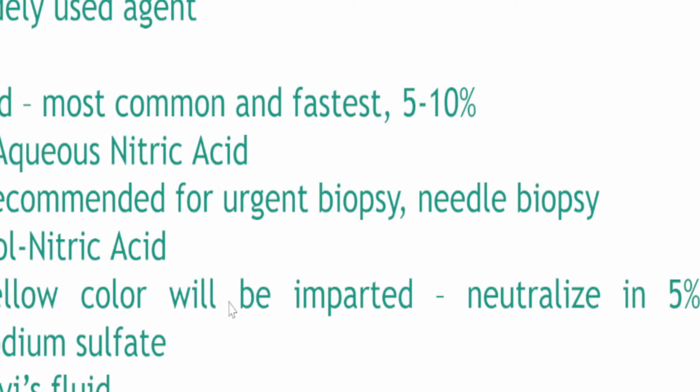Why do we need to neutralize it with 5% sodium sulfate? Because there is a yellow color imparted by formal nitric acid. Perenyi's fluid is another one. It's recommended for routine purposes. And I think that is what we use here in the University of Nebraska. I think I visited it a couple of months ago. They use Perenyi's fluid mostly when they're decalcifying samples.